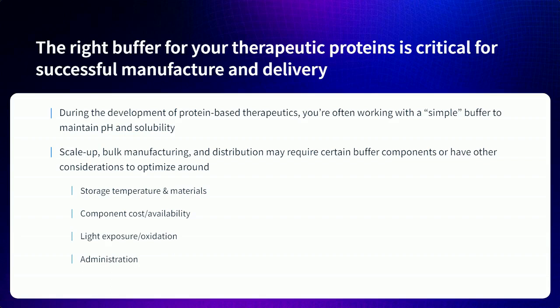Now, that's a lot of different conditions to be mindful of, and there are a lot of variables when considering the impact of buffer formulation on stability, which we'll talk about in a little bit. The goal of pre-formulation studies is to start to narrow down which buffer conditions are the most stabilizing.